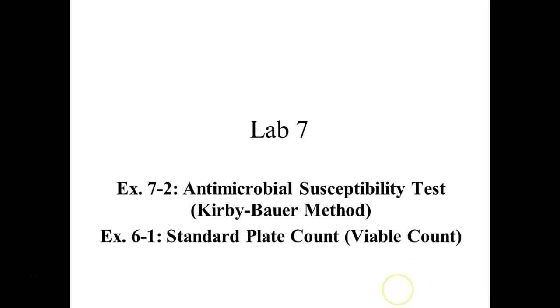All right, so antimicrobial susceptibility test. For this lab, there are lots of different tests that you could do for antimicrobial susceptibility, and I'll show you a couple others in this presentation. Just like with endospore staining and acid-fast staining, there were particular methods that we used. There was a particular method that we followed for the antibiotic sensitivity testing we did, and it's called the Kirby-Bauer method. So it's important to know that we did that particular method.